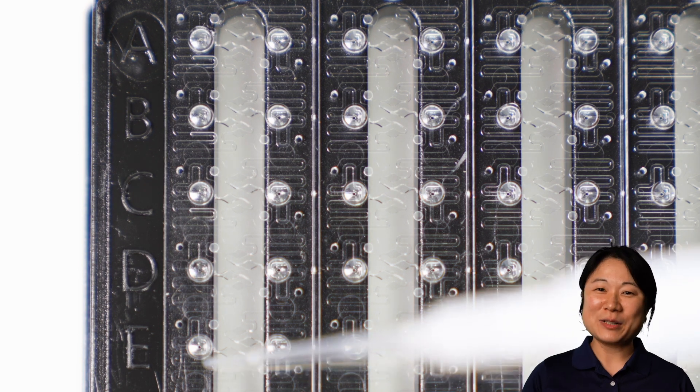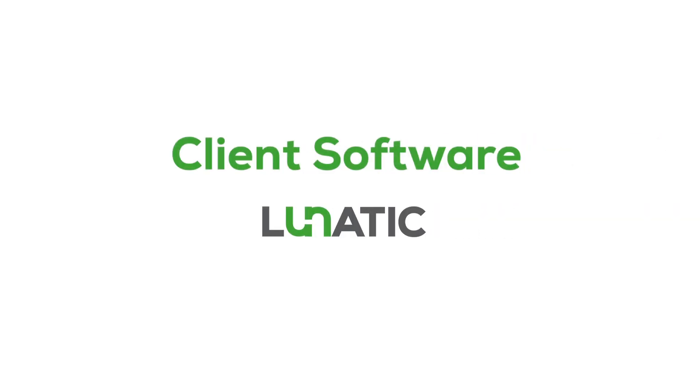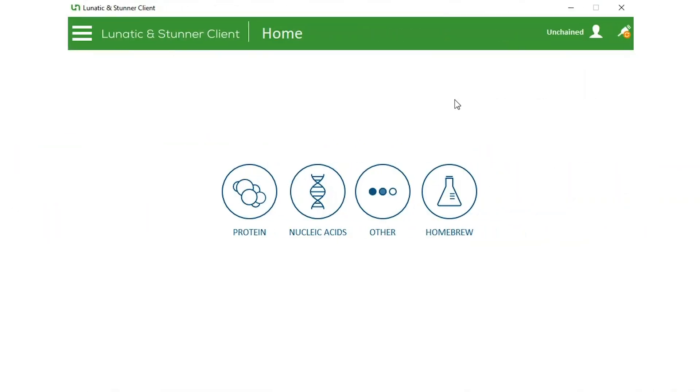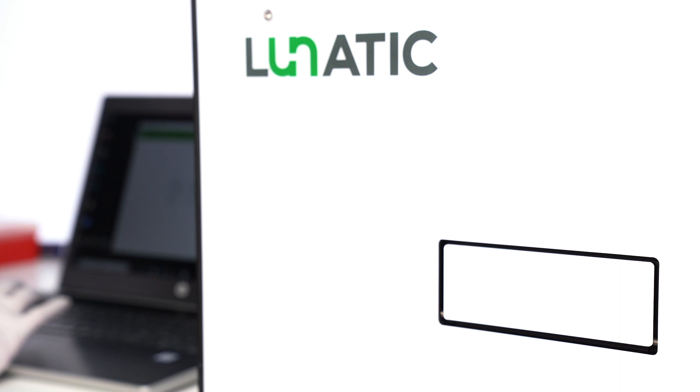Now that the plate is loaded, we can go set up the experiment. The experiment is set up using the Big Lunatic's client software. To get started, click on the Fundamentals check app.